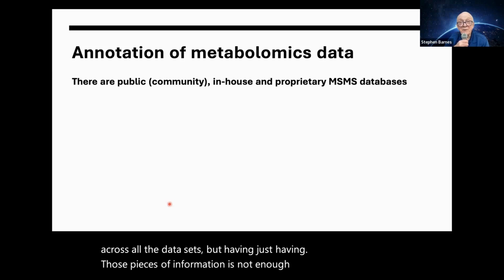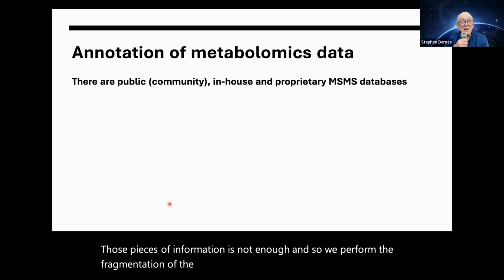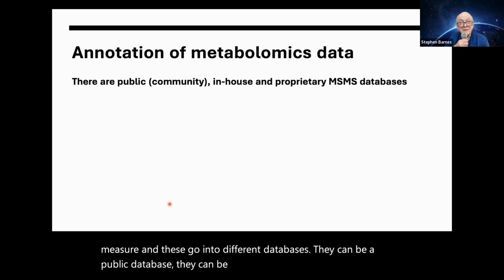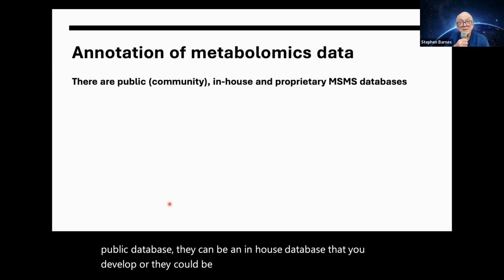And so we perform the fragmentation of the peptides, of the metabolites that we can measure. And these go into different databases. They can be a public database. They can be an in-house database that you develop, or they could be proprietary databases, which are usually expensive.